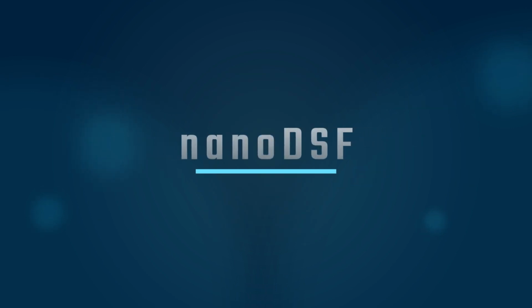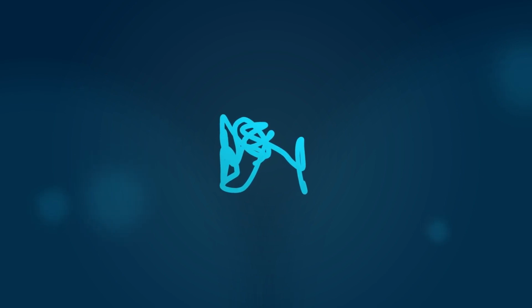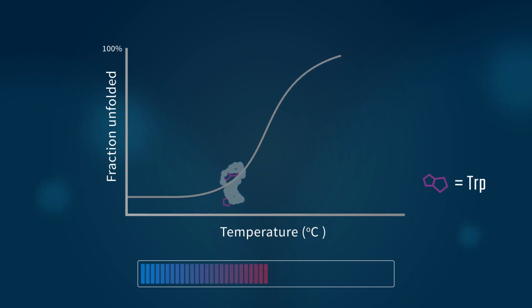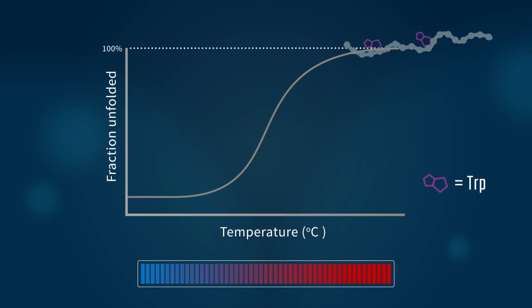Thermal stability is used as a predictor of the long-term viability of a candidate. Nano-DSF, or nano-differential scanning fluorimetry, is used to monitor protein unfolding. When a thermal gradient is applied to a protein, tryptophan residues become exposed to solvent. This changes their light emission properties.